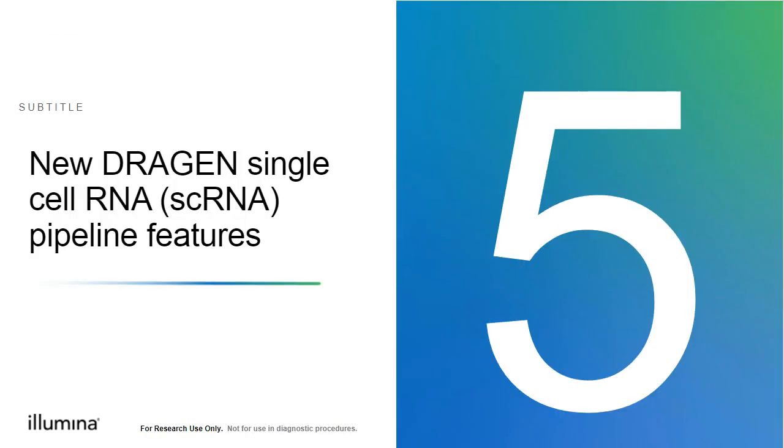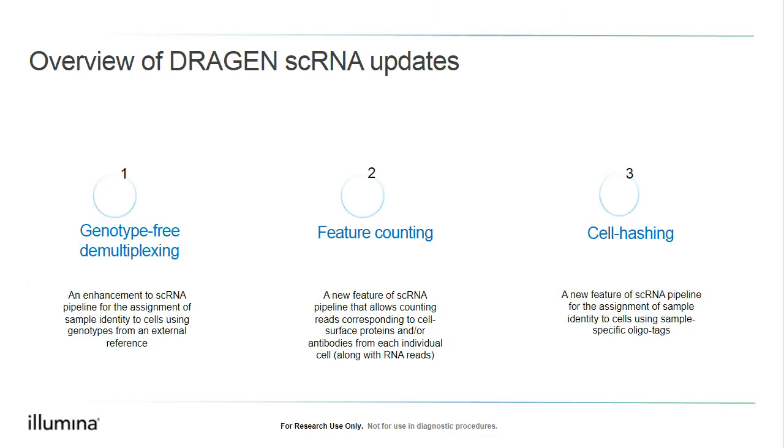Okay, let's talk about the new features in single cell. So, we've been working on the single cell pipeline for the past 2 releases, and with each release, we are bringing in some additional features as we hear feedback from customers who are using that pipeline. So there are 3 features that we have done in this new release.